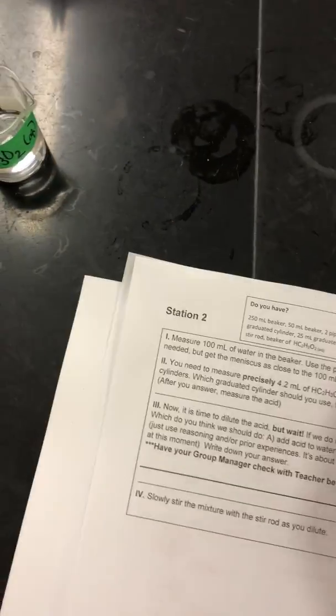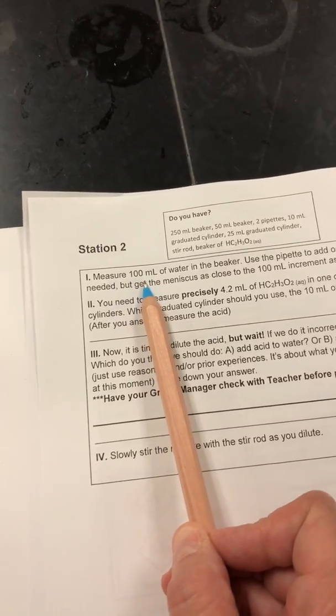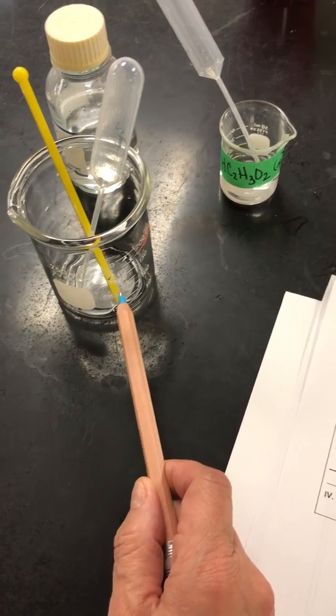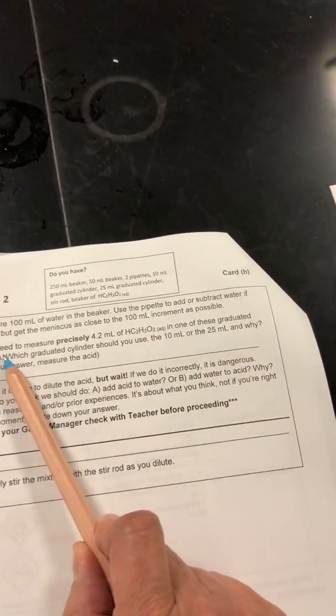And you will see your station card, and it is an exact duplicate of the one at the table. Awesome. All right, you're going to check to make sure you have everything. I know we do because we just did the lab. So here's our stuff. Measure 100 mils of water in the beaker. So you will measure 100 milliliters of water in this beaker. And then it says to use the pipette to add or subtract water if needed.